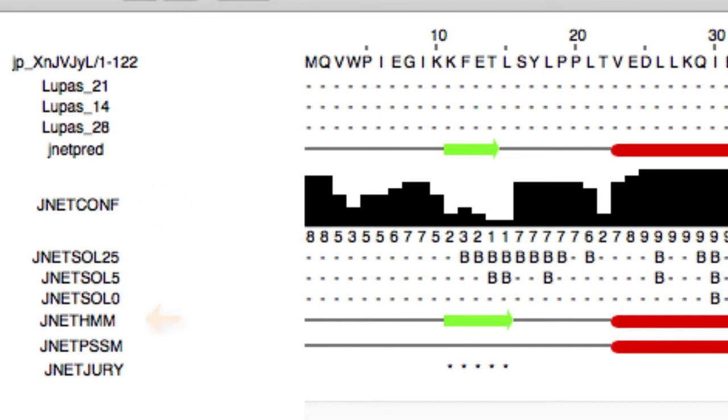The JNET HMM annotation presents the JNET HMM profile prediction, whilst the JNET PSSM profile annotation presents the JNET PSSM prediction.